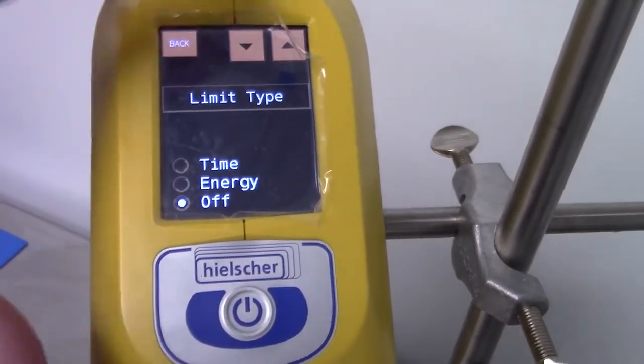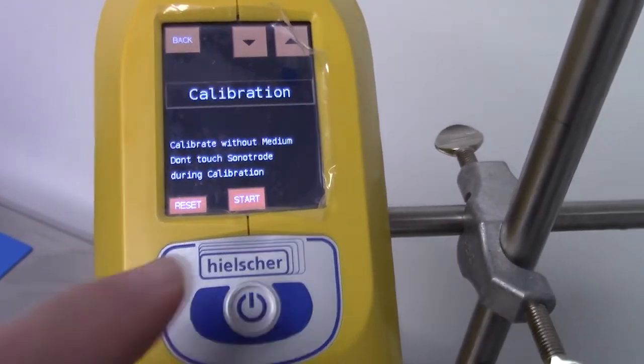I'm going to use the word settings, the down arrow, get to calibration, and I'm going to hit start.